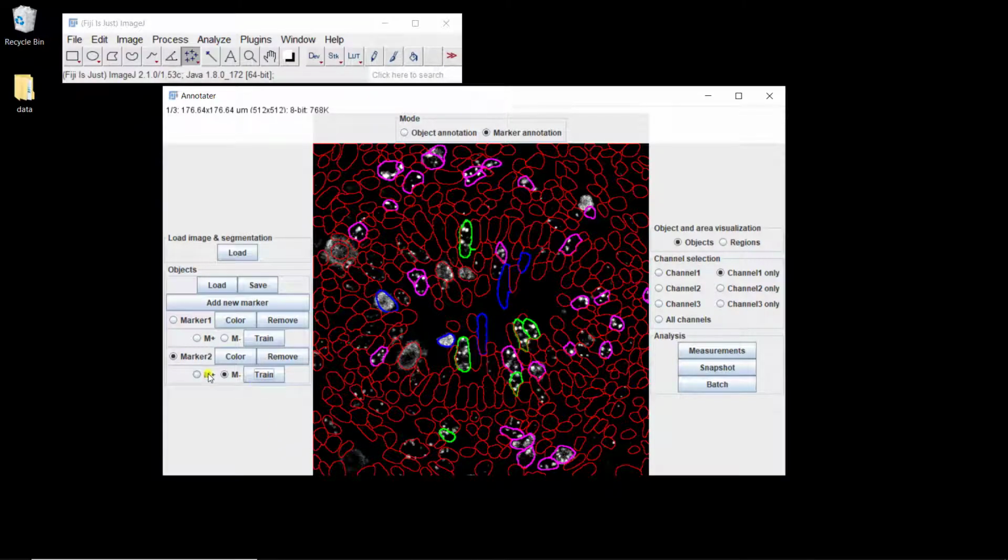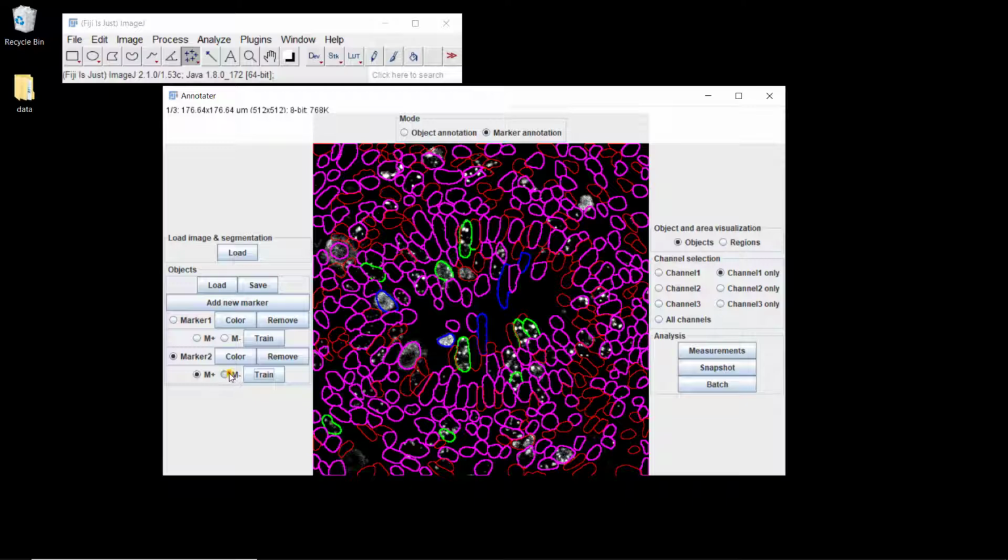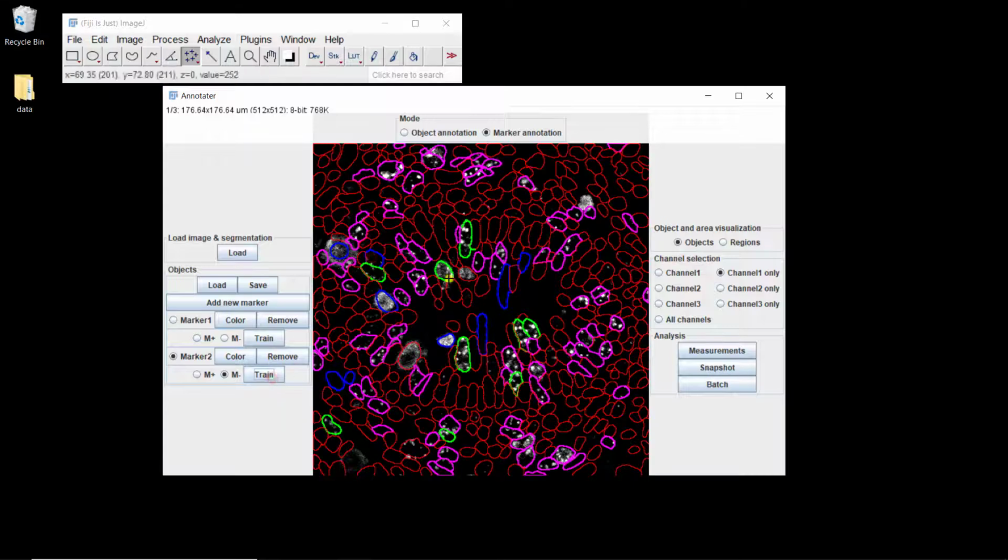Here it seems to work pretty fine, but we are missing some. So let's define them. It might be tricky, but we'll see. Yeah, now we have way too many. That's pretty common. Sometimes you just have a few steps to go over to make sure it works.